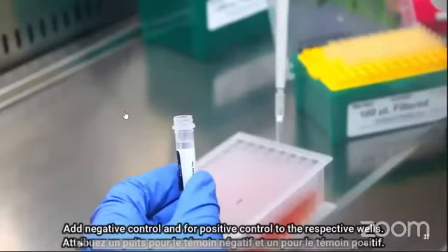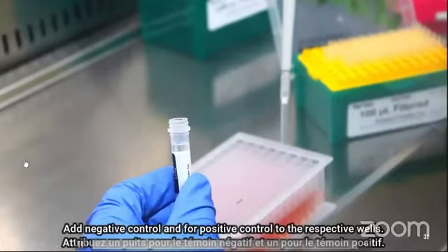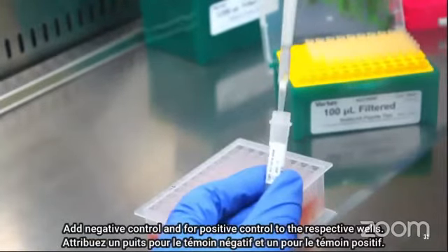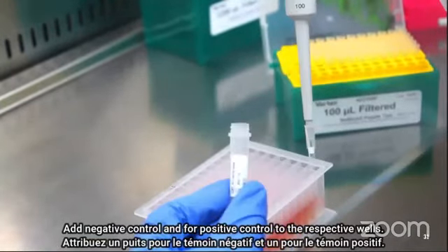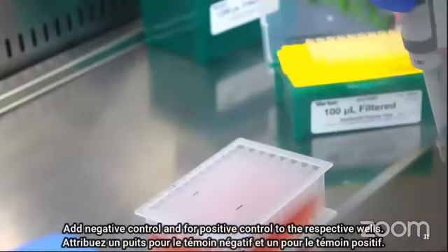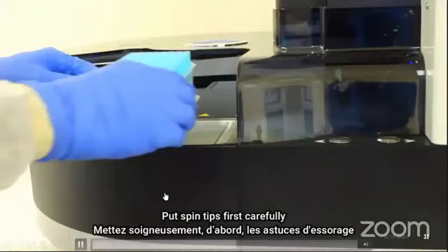After adding these extraction negative control, positive control, and all the samples which contain proteinase K and internal extraction controls, we are going to place our deep well plate into the machine.